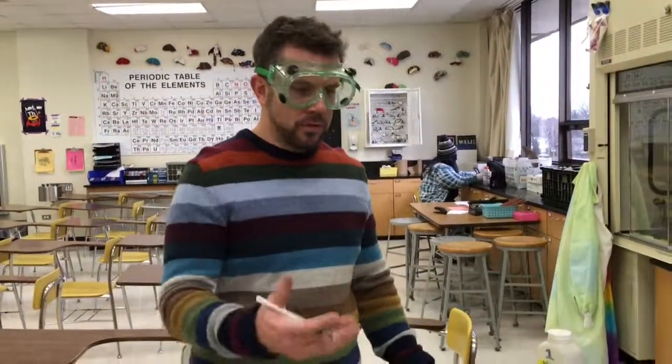And I'm going to show you how to do the Molarity lab today. So most of you just finished a quiz, and or perhaps you're absent and you want to watch this video to see how they made a Molarity solution.